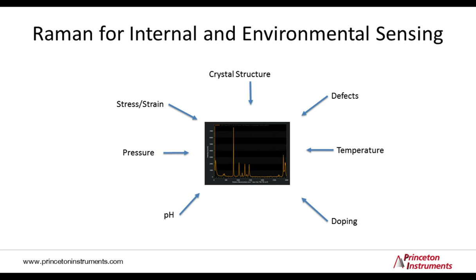So understanding the influence of, let's say, pressure on the Raman spectrum makes the Raman measurement an effective sensor for pressure. In particular, that can be useful in microscopic or remote observations that are not otherwise accessible by other techniques to measure these quantities. So let's look at a few examples.